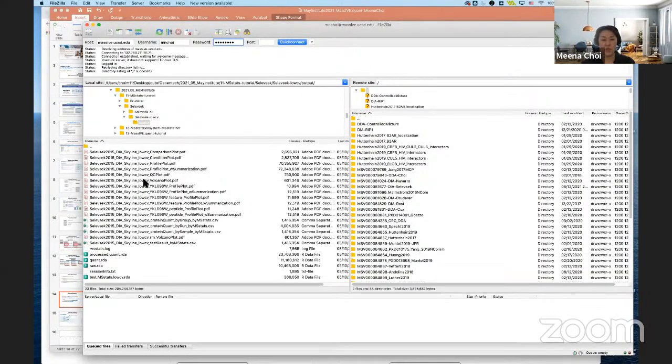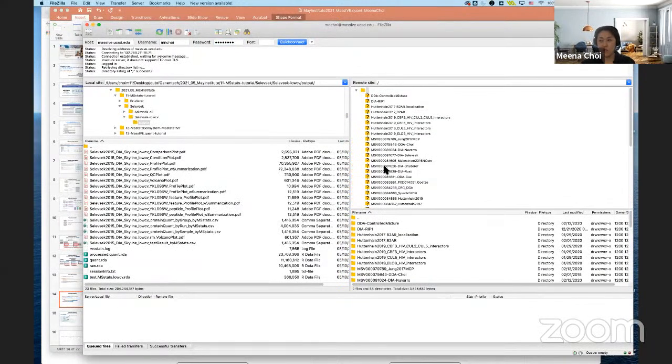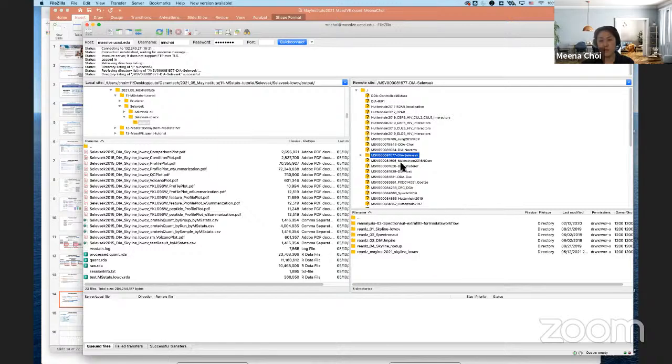So we have to transfer files to the right side, right? If it's your first time using MassIVE, it will probably be empty. But I put many data sets already there, so it looks like a lot, but it's the same as what you can play around with. So for example, I want to submit a selected data set that we practiced the last couple of days to MassIVE.quant. So here's my space.